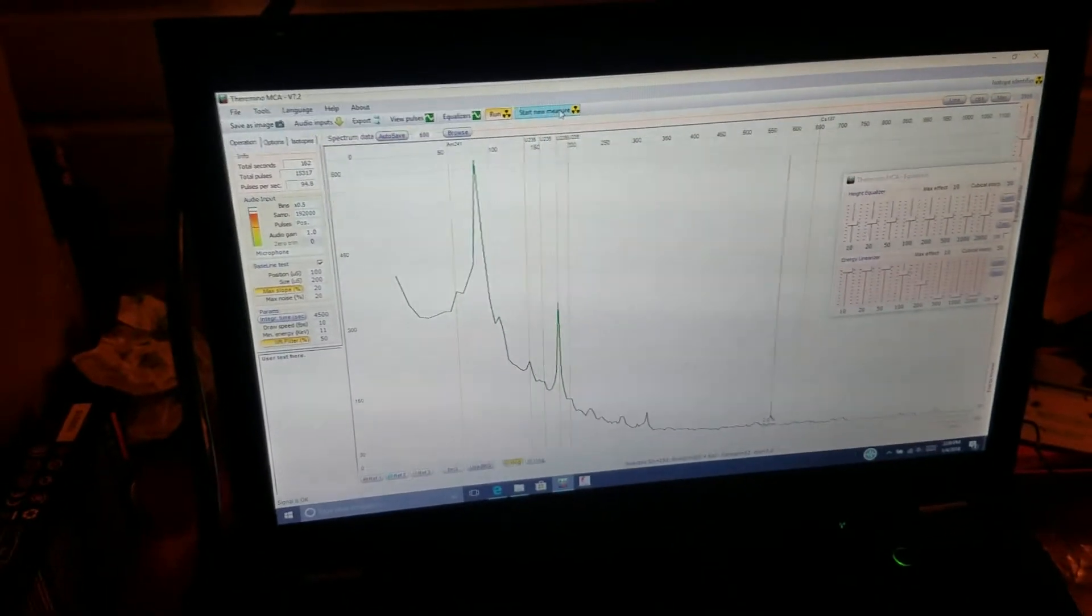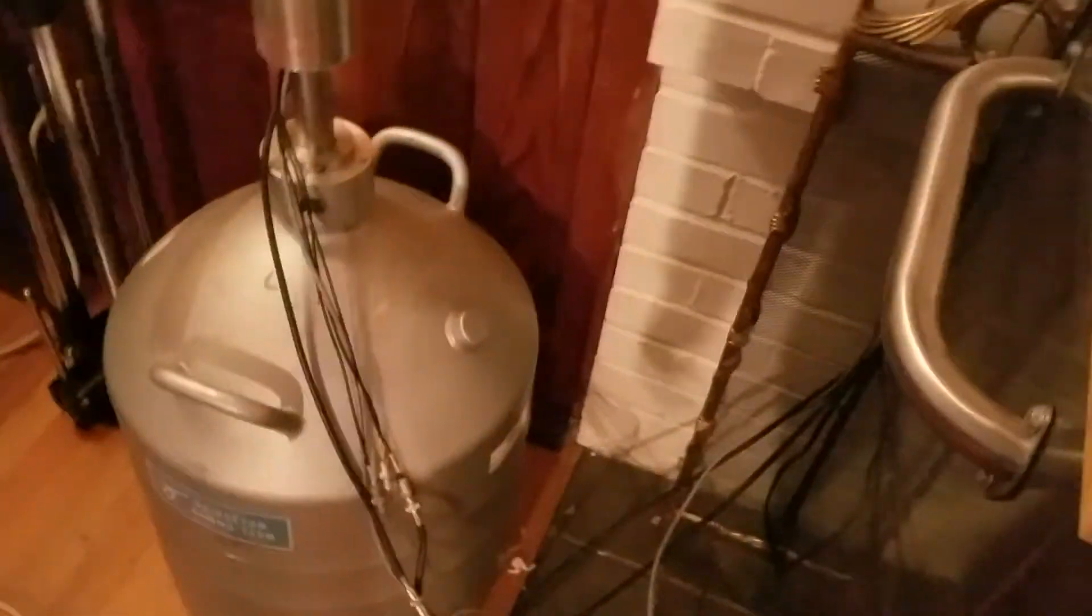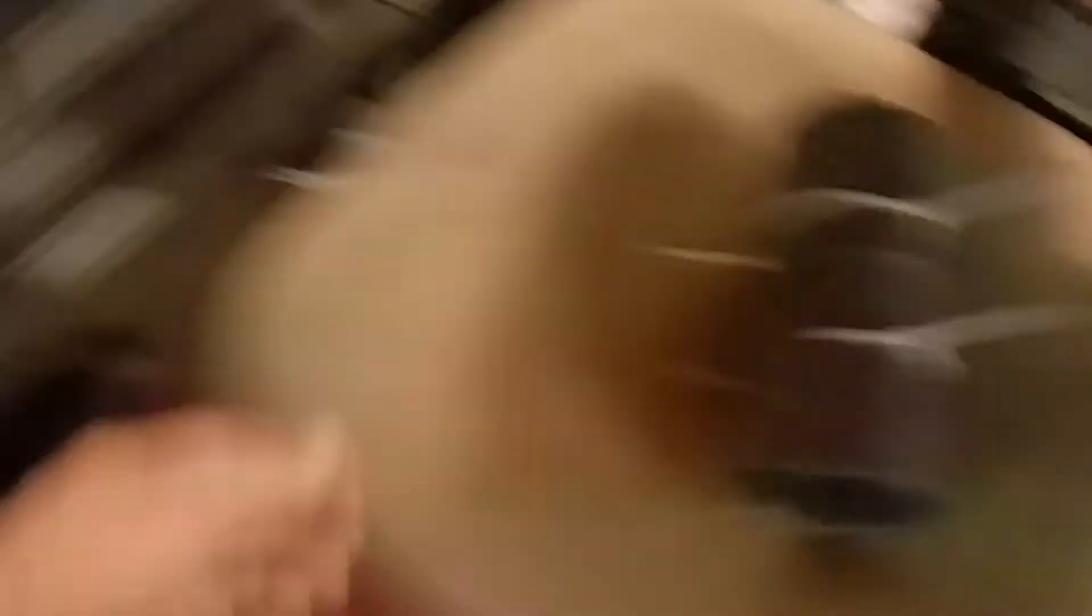Anyway, so let's take a quick spectrum and see what kind of resolving power we have. Actually before I do that, I'm going to just pop some lead on.